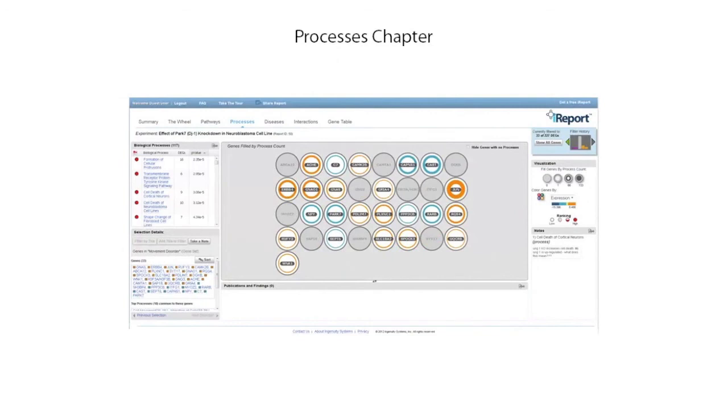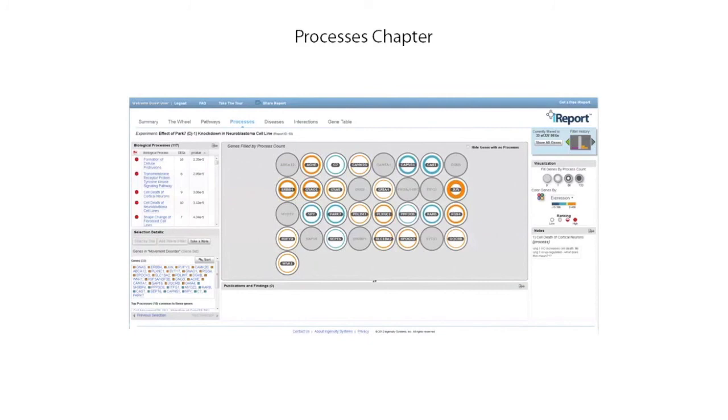The process chapter reveals which biological processes are most significant to your subset of genes. Clicking on a particular process highlights the genes involved in that process and provides supporting literature citations at the bottom. This helps you understand which groups of genes are related to common biological processes and allows you to relate that to other factors, such as expression level or gene interconnectivity.